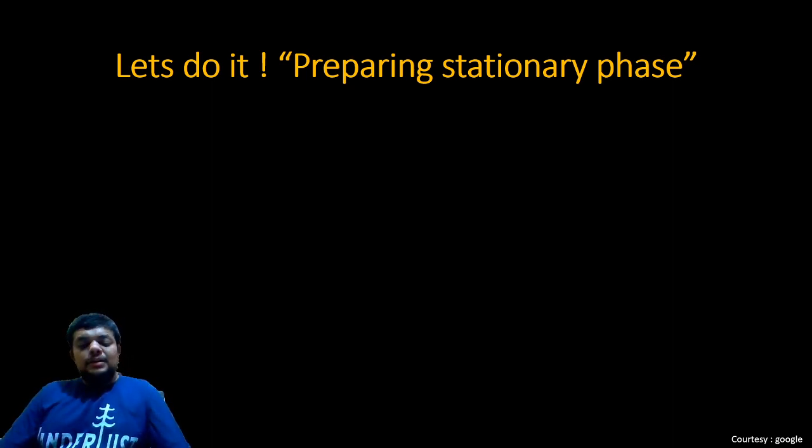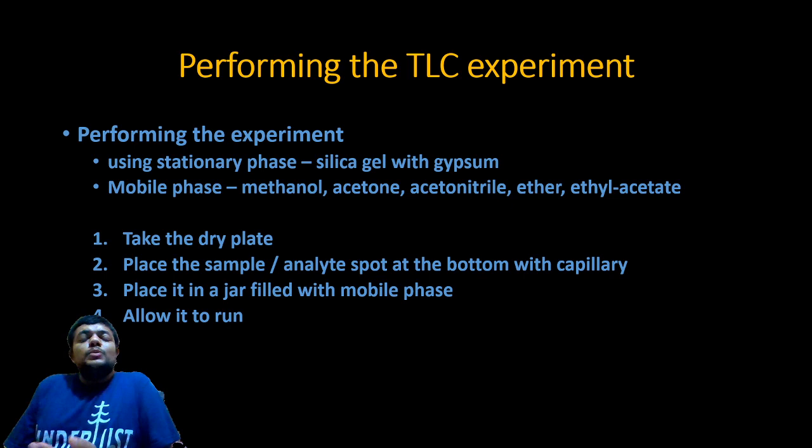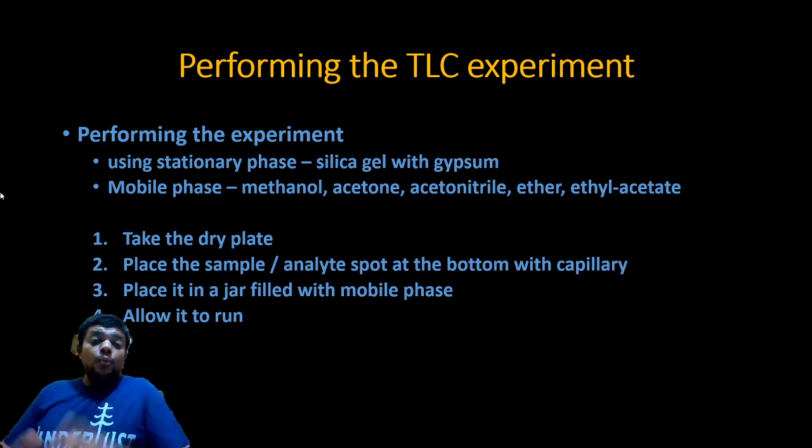Moving further, with a hope that you have understood it completely from this very interactive video, performing the TLC experiment. Now, once I have a TLC plate with me, how to perform the experiment? So, use stationary phase as silica gel G with gypsum as a binder.